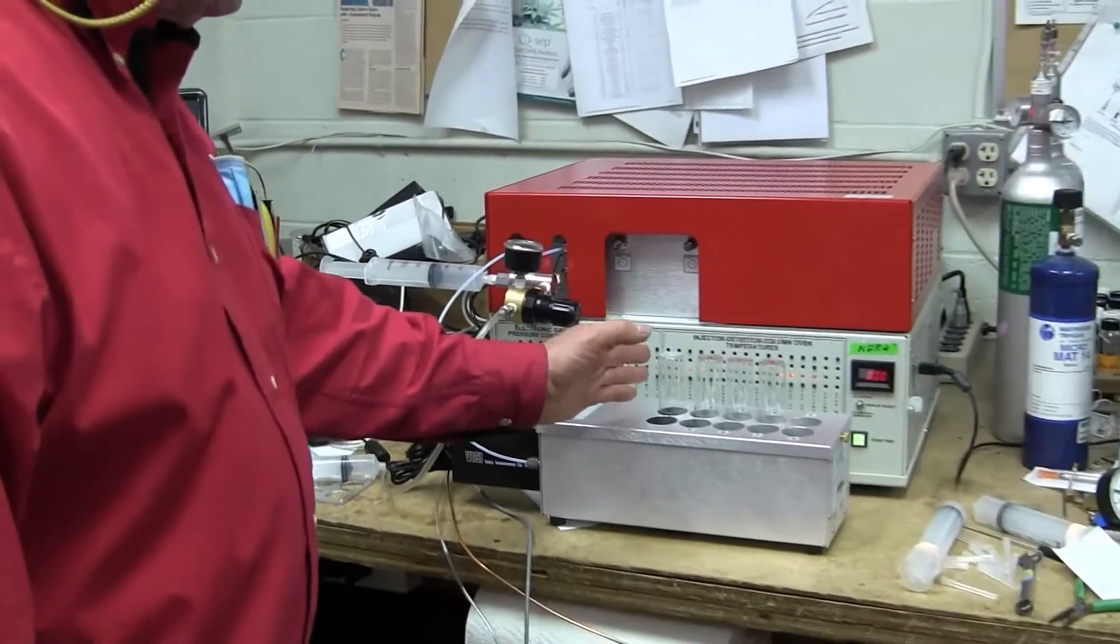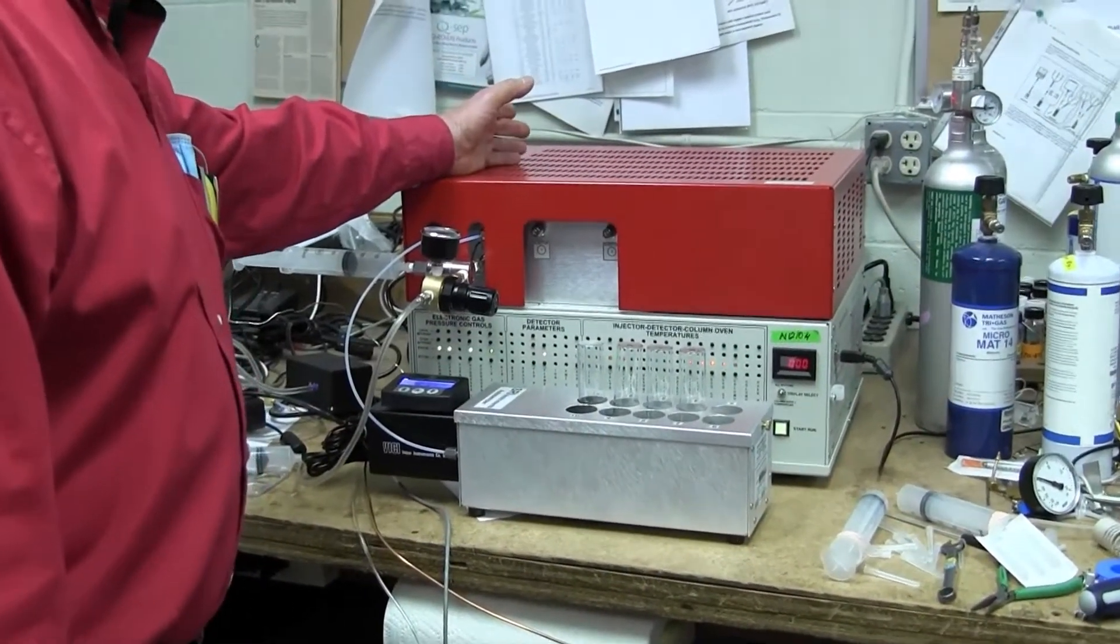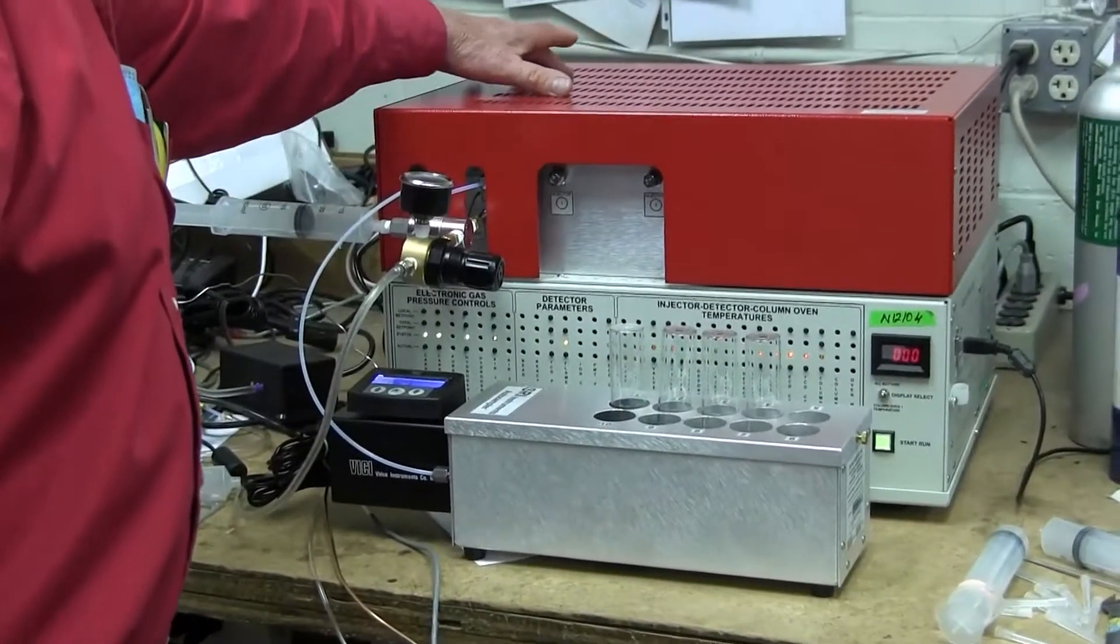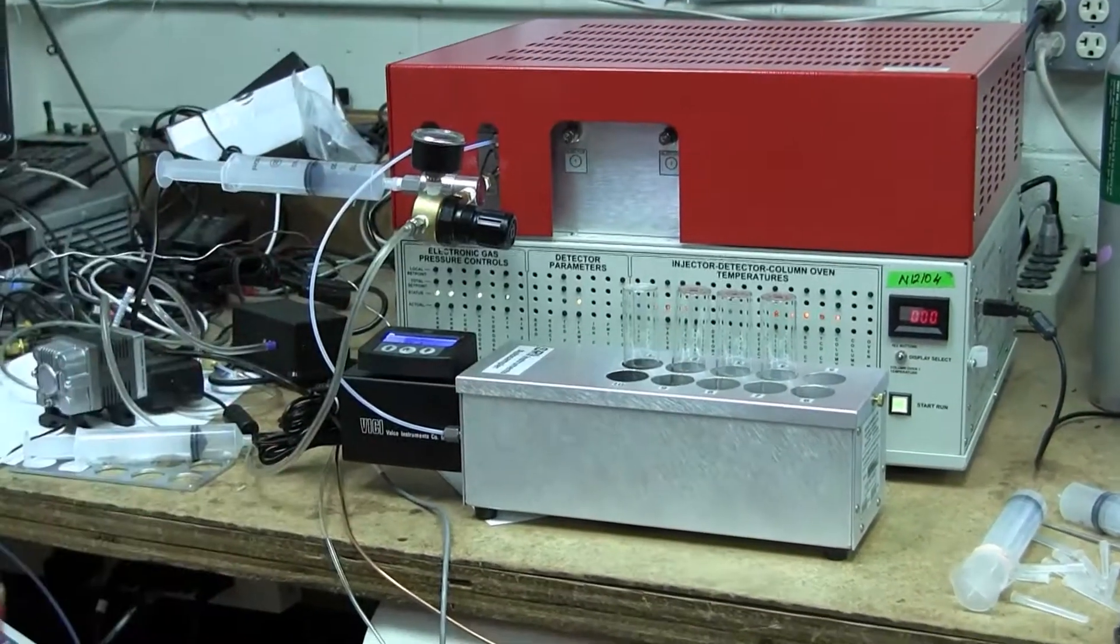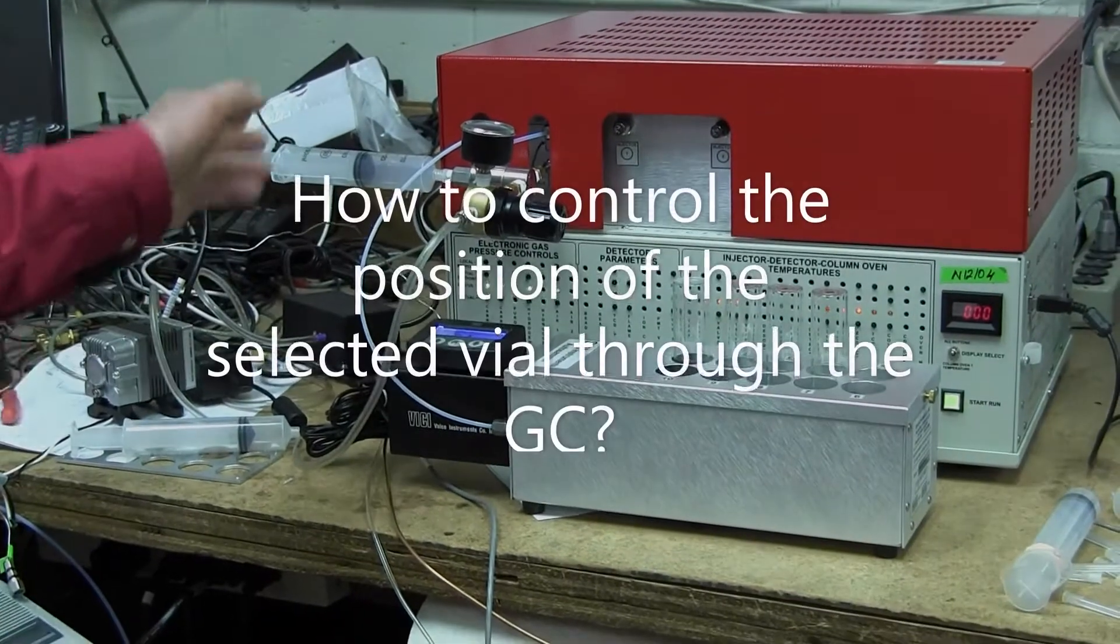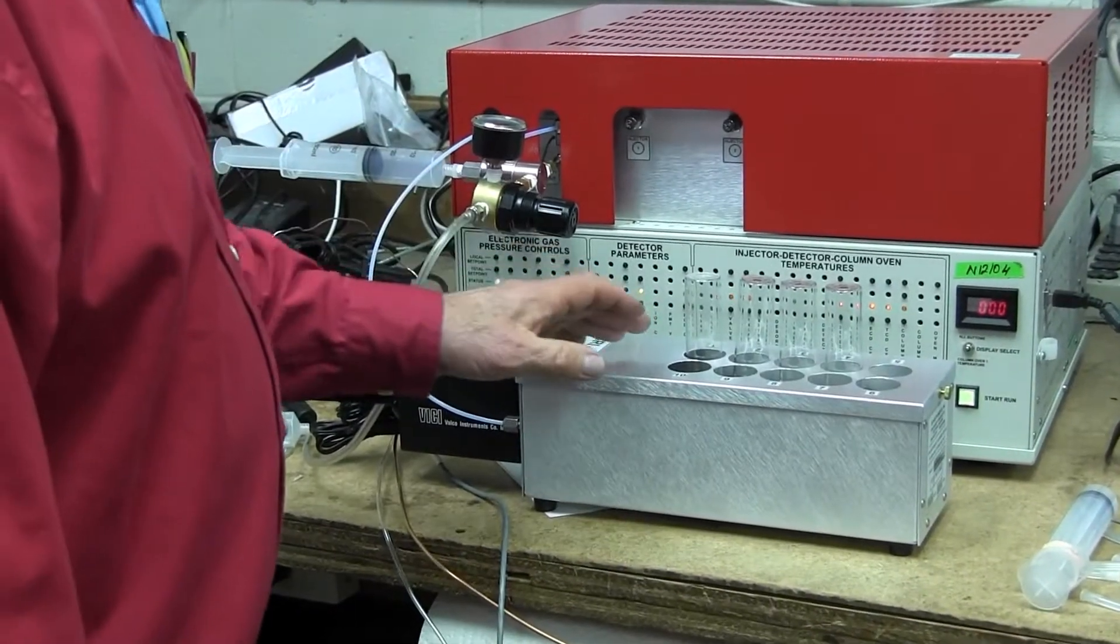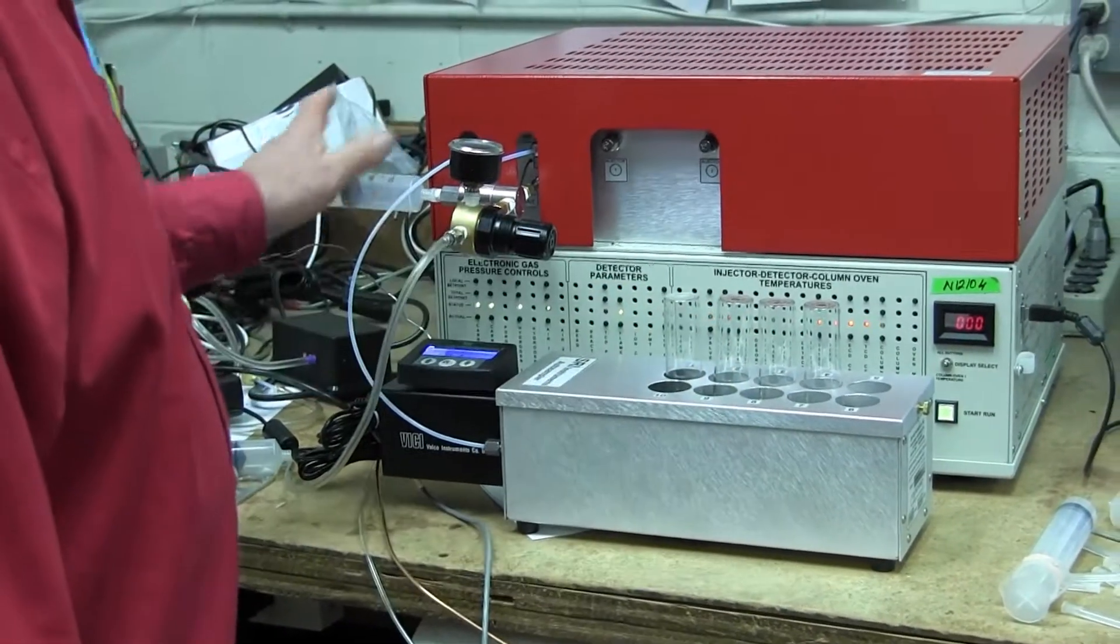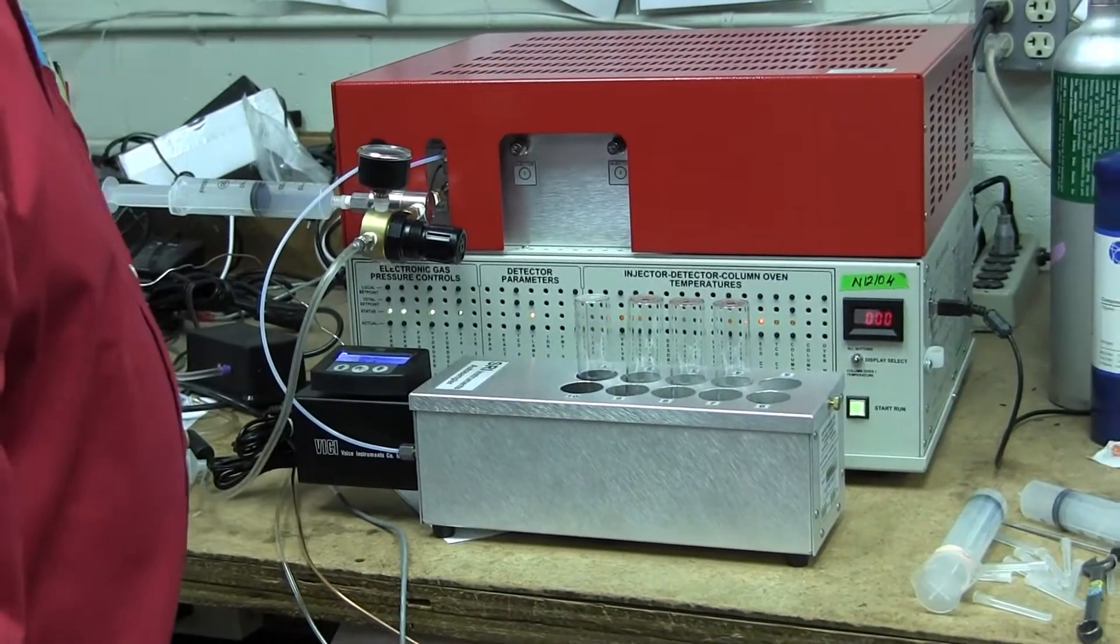So that's how the sample gets from the vial and then into the loop of the gas sampling valve and then when that valve in the GC rotates, whatever's in the loop gets pushed onto the column. So the question is now, how do we avoid contaminating the next vial with the residue of the gas that's in the tubing and all through the system right now?